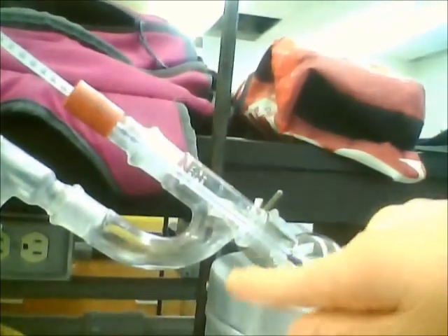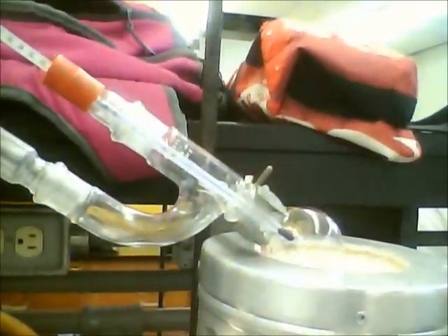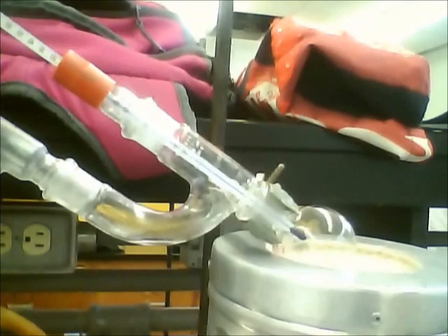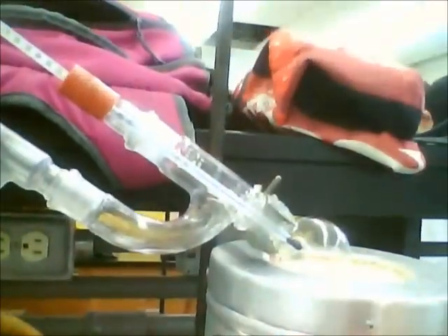This is the result of our short path distillation. It leveled at about 75 degrees Celsius. It didn't quite reach 80 just because we had such a small sample, and you can see we definitely had much less than the milliliter that we started out with.